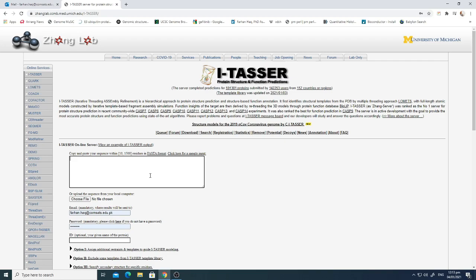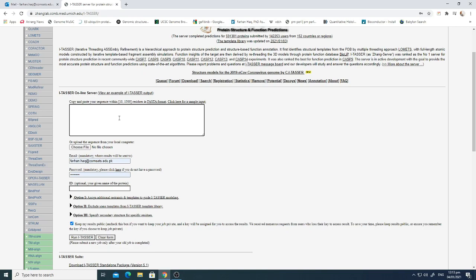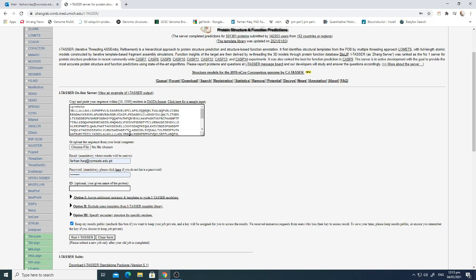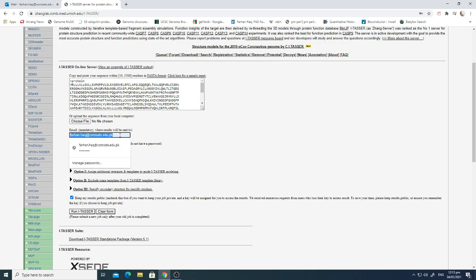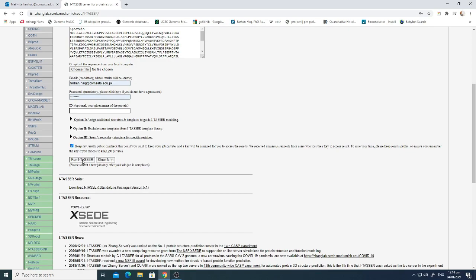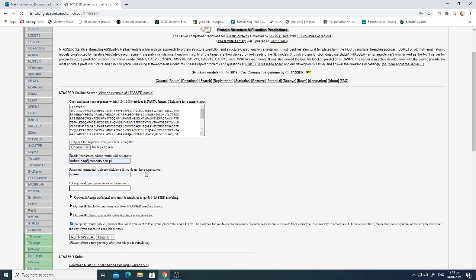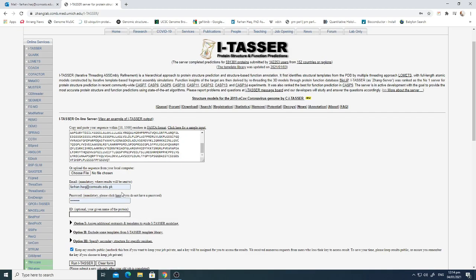To get started, you need to paste the sequence of the protein whose structure you want to predict. You also need to register — if you don't have a username and password for this tool, just register. After entering your credentials and clicking 'Run I-TASSER', don't expect results right away; it takes around two to three days to predict your structure.